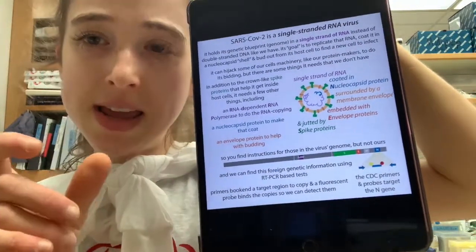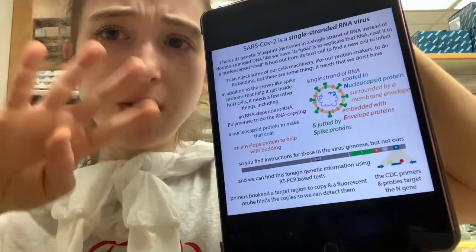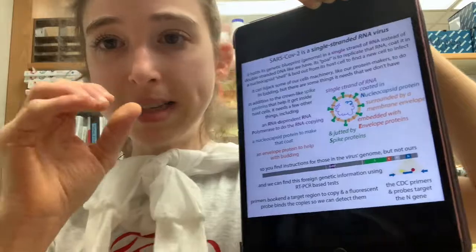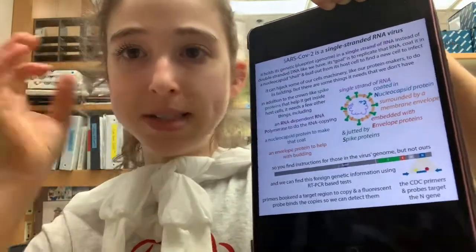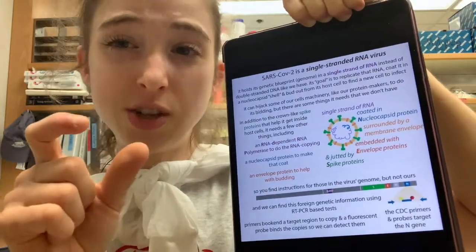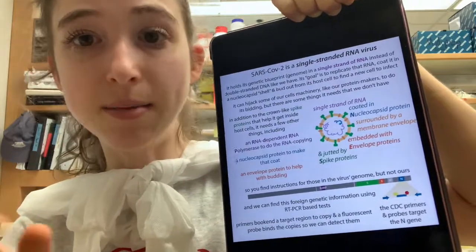DNA and RNA only have 4 letters. And so you can have sequences that look pretty similar, because we're using short sequences, remember. If you have random sequences, eventually some of them will just happen to match. So we need to make sure that our primers are really specific for this virus, so they're not going to accidentally bind to something in our own DNA.